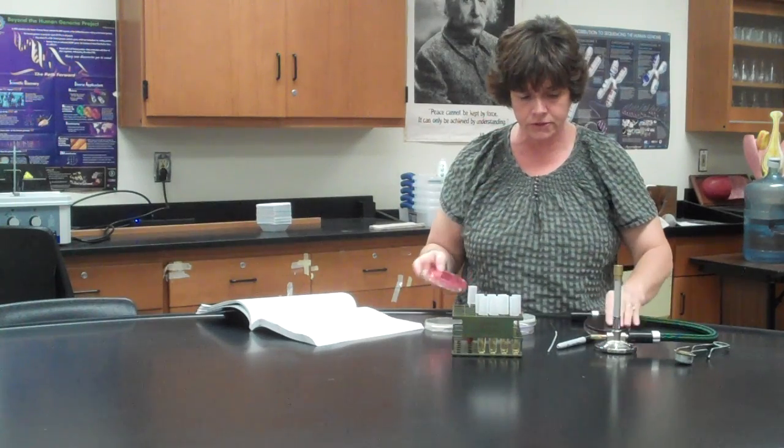Okay? So I like this lab because of the different colors. I like colors, I guess. So you have some varying red colors. So like the blood agar is a very kind of a bright red, and you can't really see through it. The mannitol salt is also red, but you can see through it. We have the MacConkey, which is a little bit lighter and pinker. And then the eosin methylene blue is more of a burgundy color.